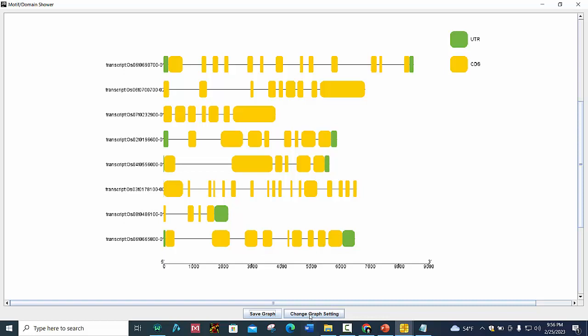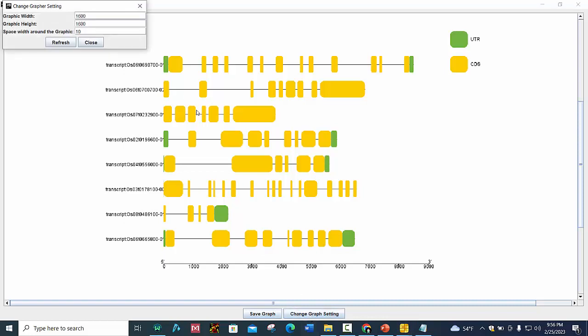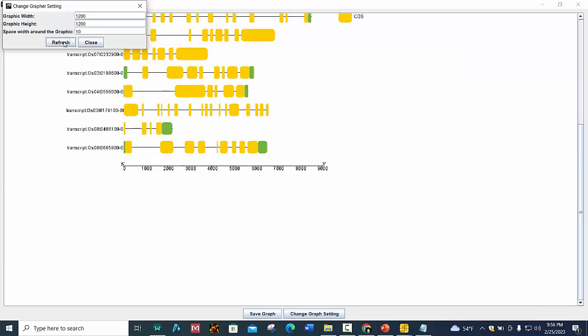Here you can change graph width and height. Here I am selecting 1200, here is also 1200, and press the refresh button.